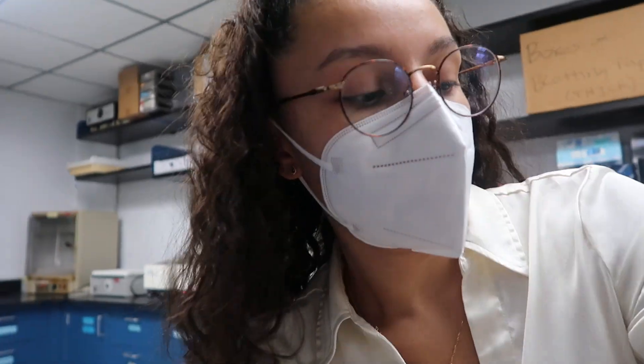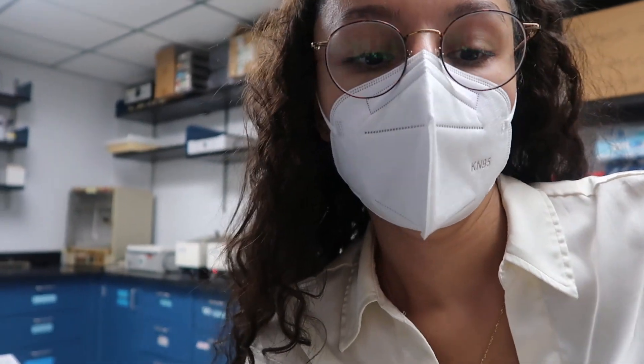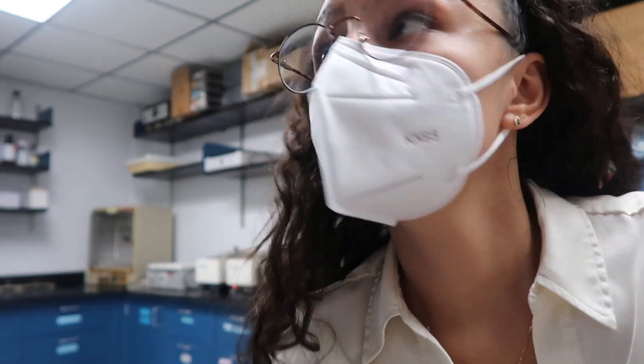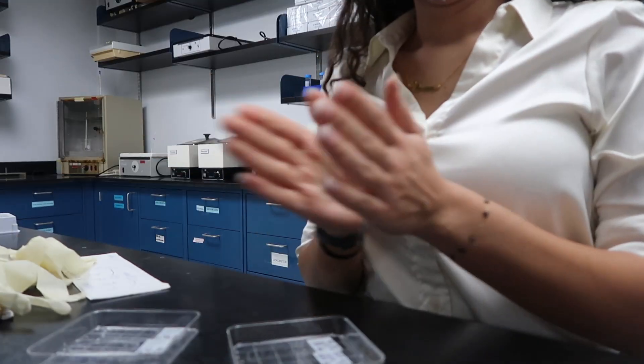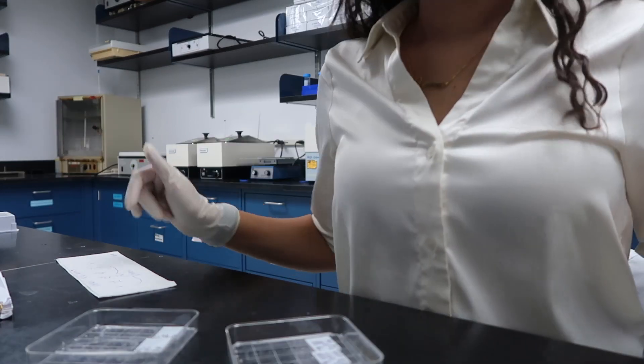Okay, washes are done so now I'm going to dry off my slides with Kimwipes and apply this Southern Biotech Floramount G, which helps maintain the fluorescence. But first, gloves. You like those editing skills? Okay, where's my Kimwipes?